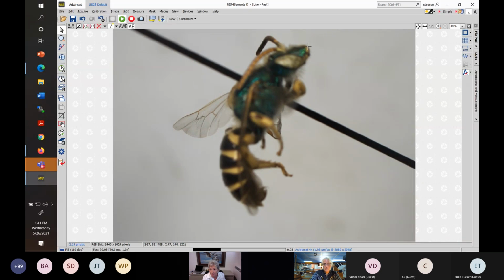And then you have the general problem of, see this head? So this head is cocked out, and it also could be cocked down. So this face could be at right angles to the body line, and so this is longer in that position than if it was bent down. And this abdomen is all curled up. So if I measure from there to there, it's certainly shorter than if that abdomen was bent up and straightened.